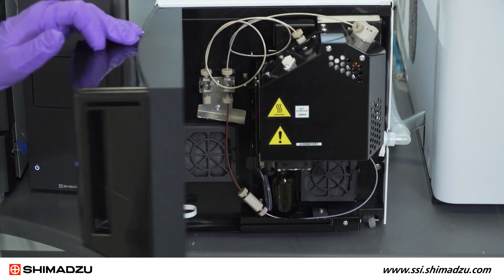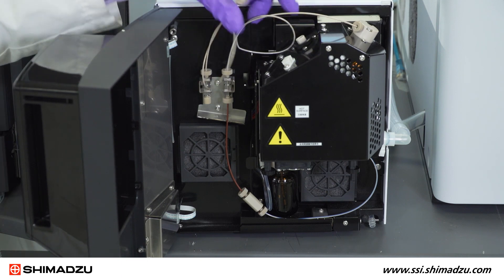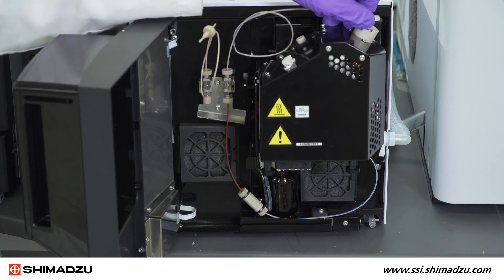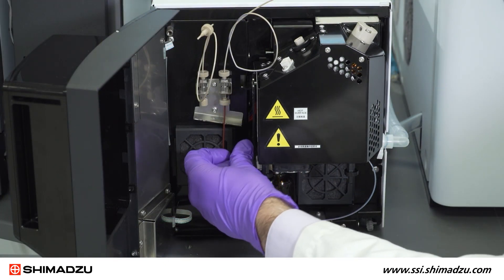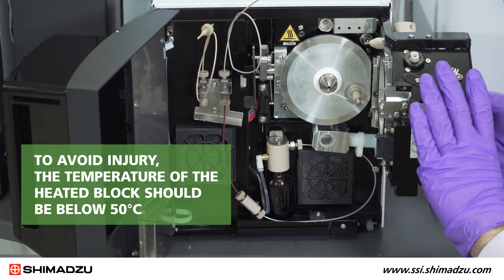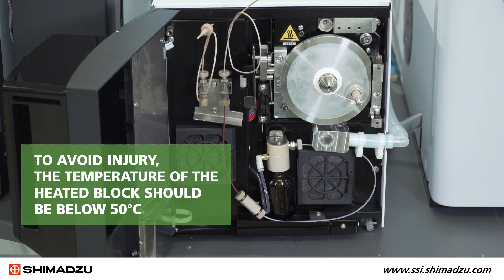After turning off all gas flows, heaters, and voltages in the LabSolutions software, remove the LC connection tubing. Unlock and remove the ionization unit. To avoid injury, the temperature of the heated block should be below 50 degrees Celsius before you remove the unit.